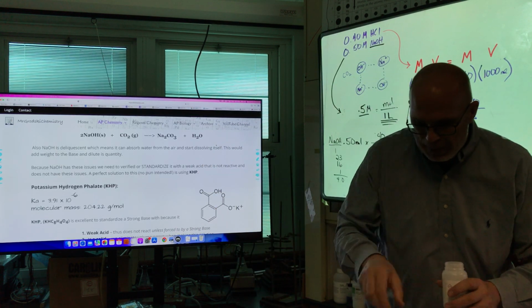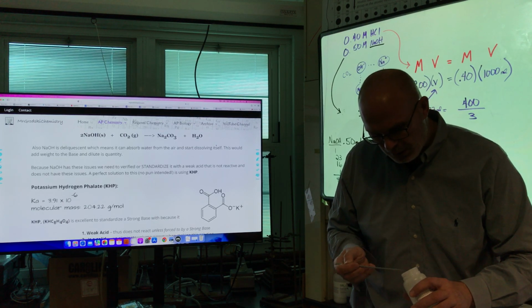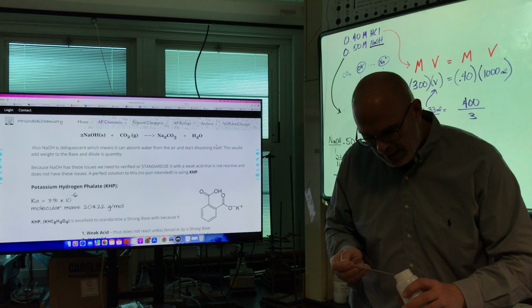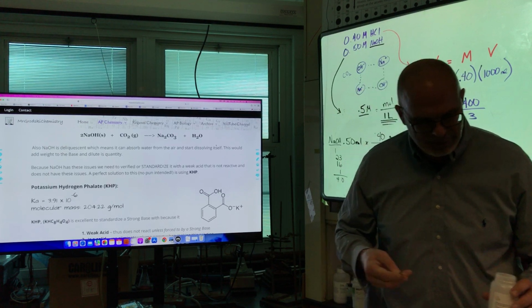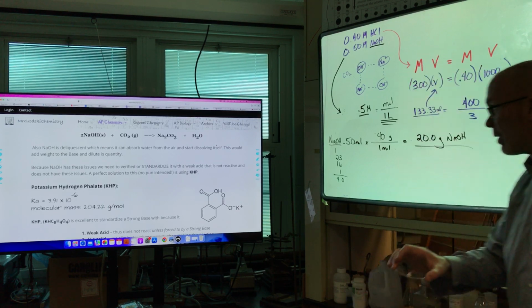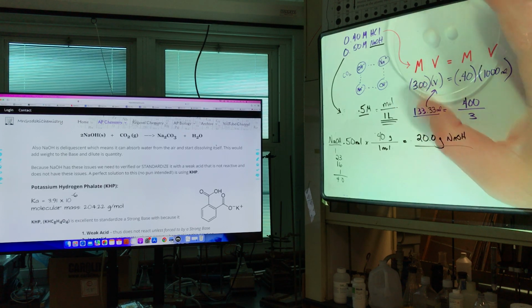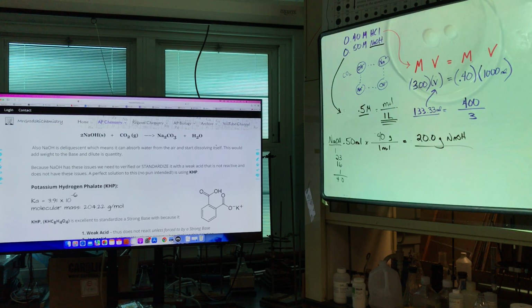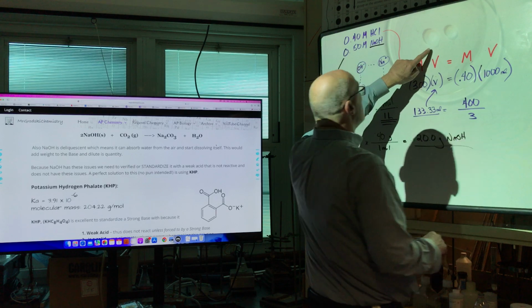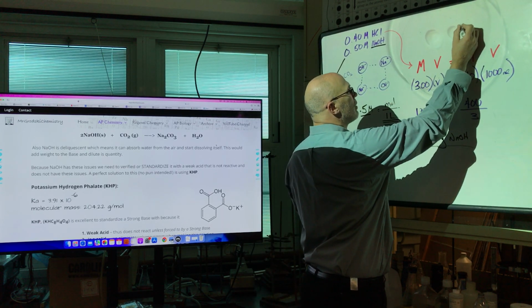So what I'm doing here, party people, is I'm going to put a pellet of sodium hydroxide. They come in like little round pellets. And I'm going to put it next to the one I've had out cooking the last day. I feel this is like a cooking show. Okay, and you're going to tell me which one you think was sitting out overnight. So here we go. I know it's hard to see. I used to have a black piece of paper here, but any case, here is my little pellet right here that I just put out.